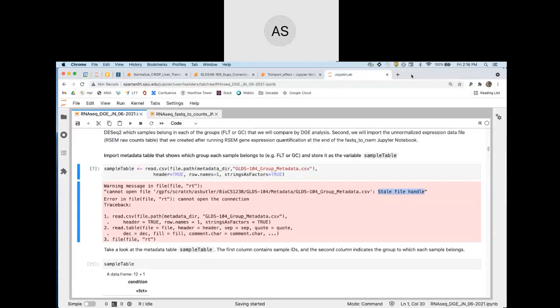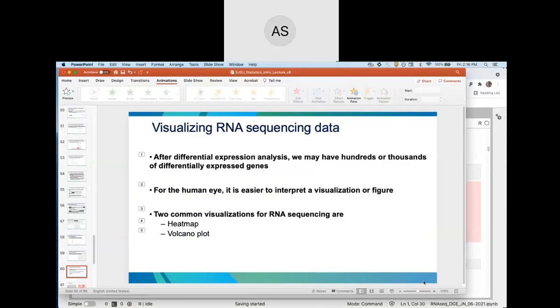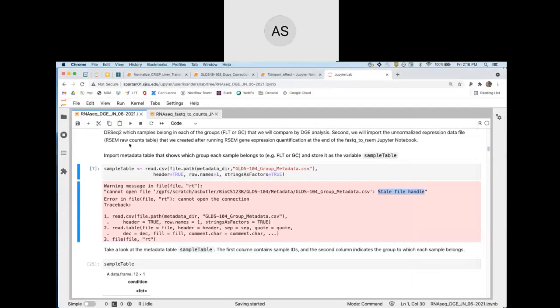So all of the data that we're pulling from the GPFS, whatever that acronym is, storage space on the cluster. Yeah, and I just did a DF and it looks like something happened with that mount. So the mount to the storage space where the data is fell off. Oh no. Usually you can remount it fairly easily. Steven, do you think you'll be able to do that?